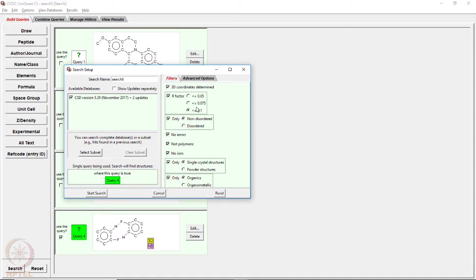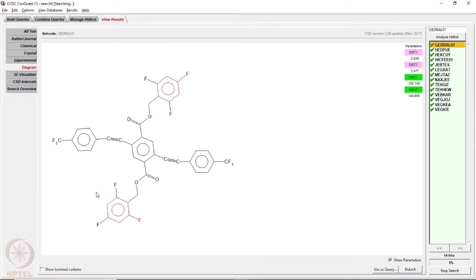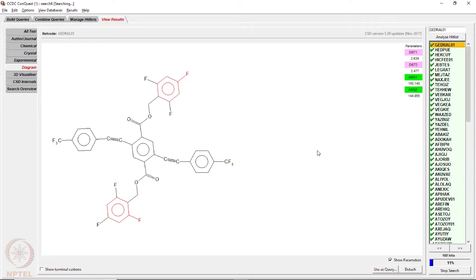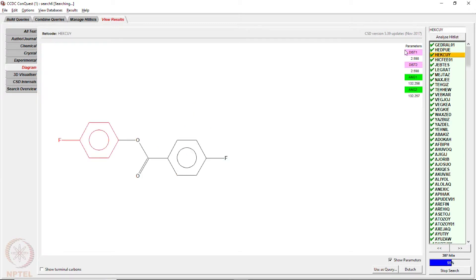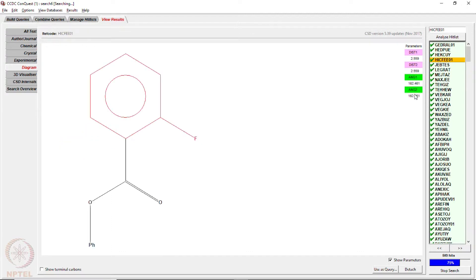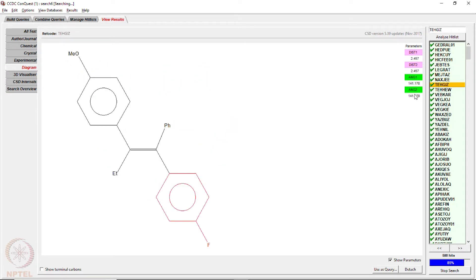During the search, the search engine looks for structures satisfying the 3D requirement of two aromatic rings coming closer, plus the set of structural restrictions added. Those restrictions reduce the number of hits. The number is still increasing — at only 25 percent it already shows about 200 structures — so this may have about 1000 structures meeting the search criteria. On the top right corner, the distance ranges and angles for each molecule are indicated.